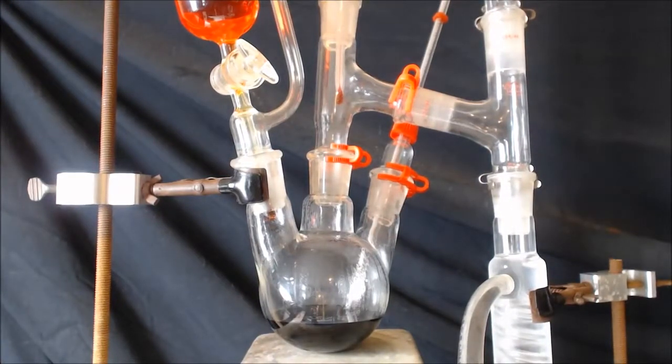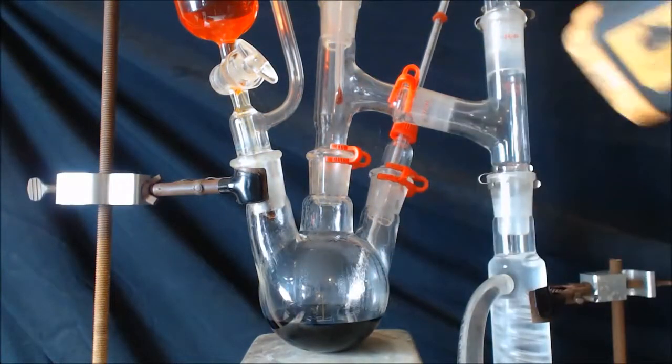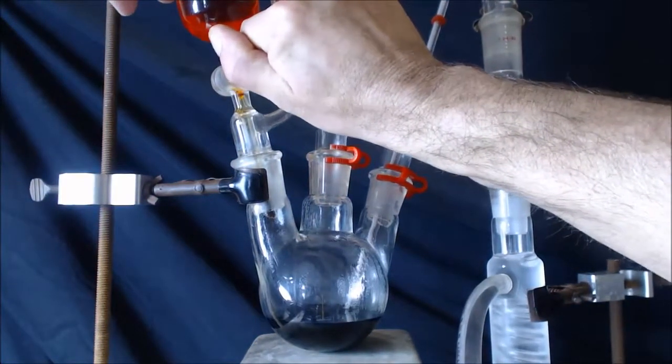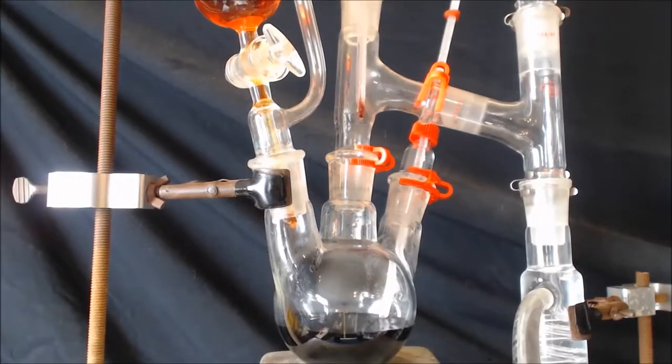Well, subtle heat isn't working, so I took the water bath off. I'm actually giving it some heat. Have the hot plate up to 111°C. Alright, I can't get nothing to come off, so I'm just jacking up the heat.